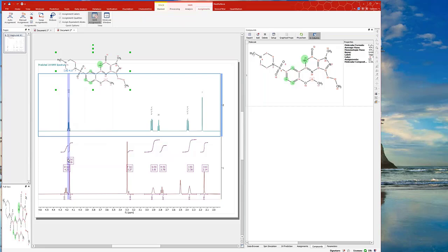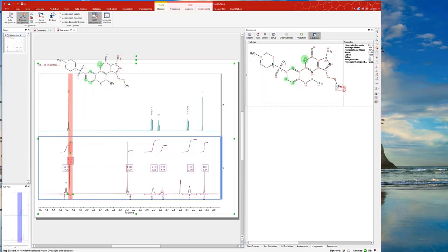Yeah. And then I click here, 18. Right. This one, the singlet methyl group, which should be 18. No, should be 33. This methyl group, right? So I did that. Yeah, I can carry on. Here it's like a very small singlet, 0.44. Yeah, I think we can ignore that because this seems to be an impurity, right?